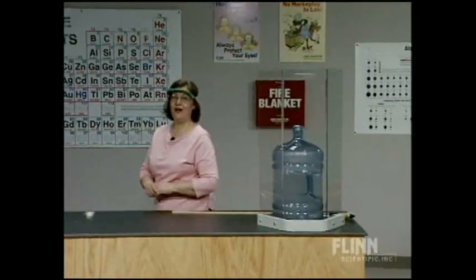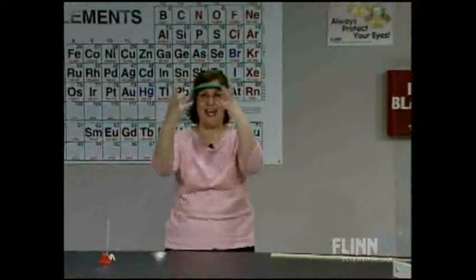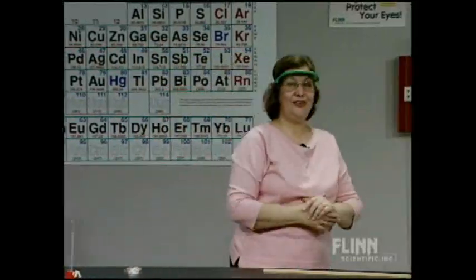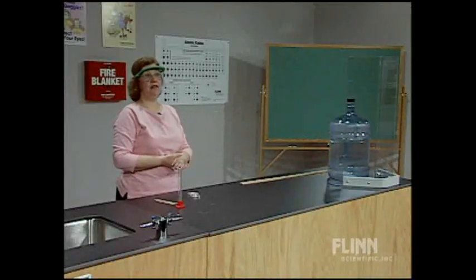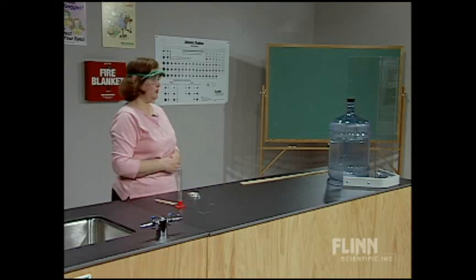Very good — a great, fun demonstration! The combustion of isopropyl alcohol vapor. Did you hear that whoosh sound as it all just came out of the jug? And then you got a little bit of afterburning — you saw that yellow flame kind of go back down and almost a ring of fire in there. It'll look great on slow motion. The combustion of isopropyl alcohol — a terrific combustion reaction. There are a lot of things you can do with it. What's going to be left in there? It's water. You could pour that water out and find out how much water you produced in the combustion of an alcohol.